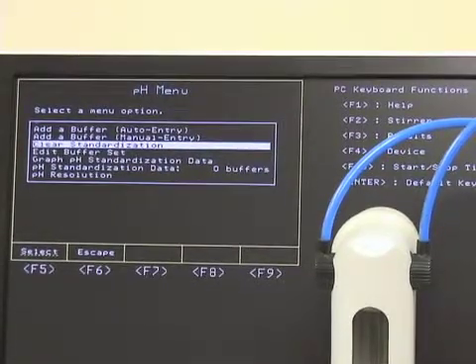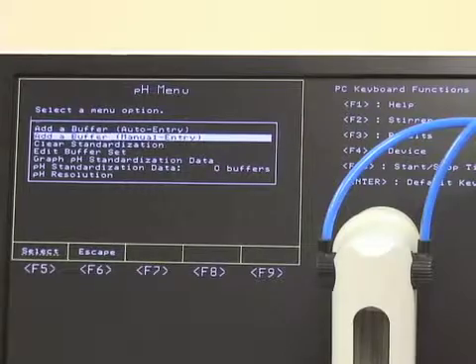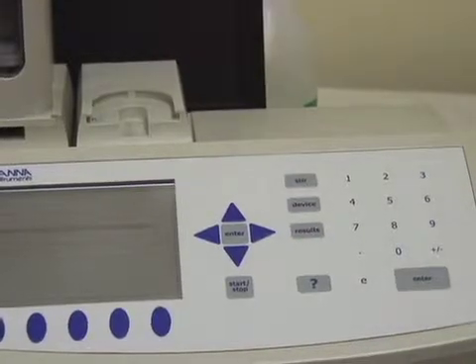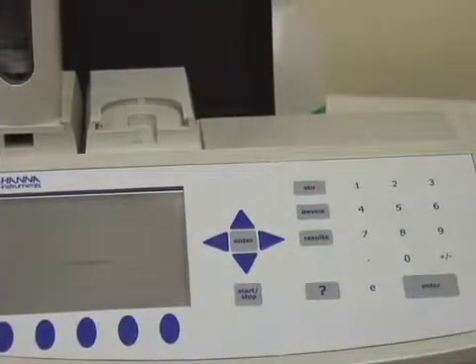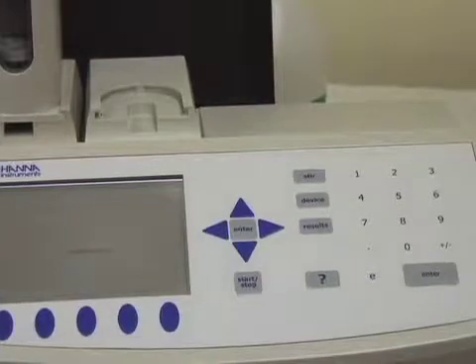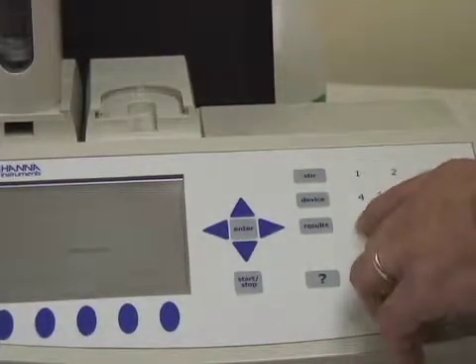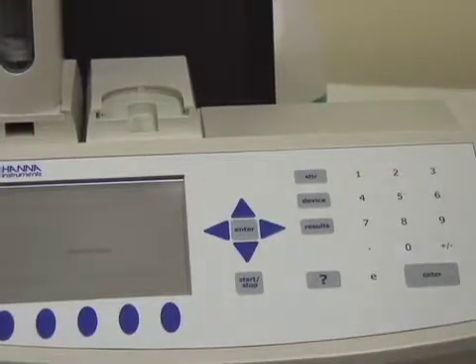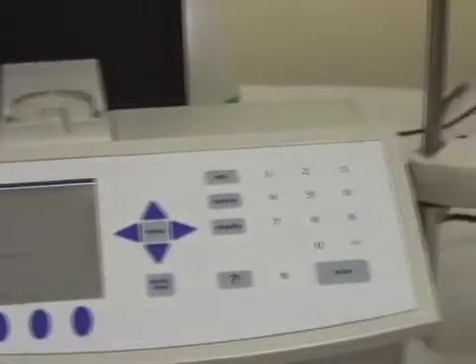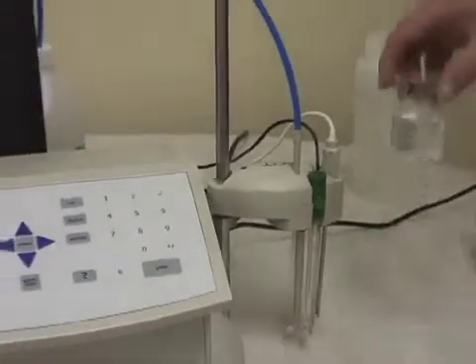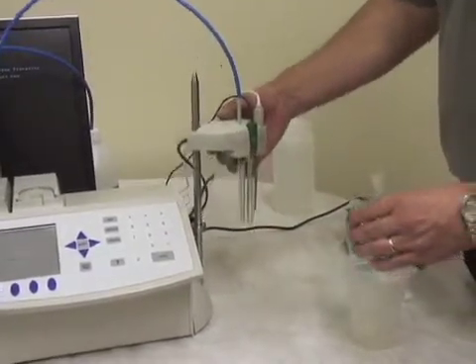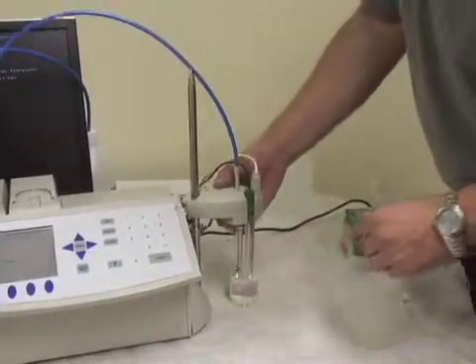We're going to start by adding 7.01 — you should always start at your neutral 7.00 or 7.01. So we'll select add a buffer manual entry. Right now it's set up for 3.01, so we'll type in 7.01 on the keypad. Now you'll want to prepare your sample underneath your probe. We have our buffers marked so we don't get them confused.